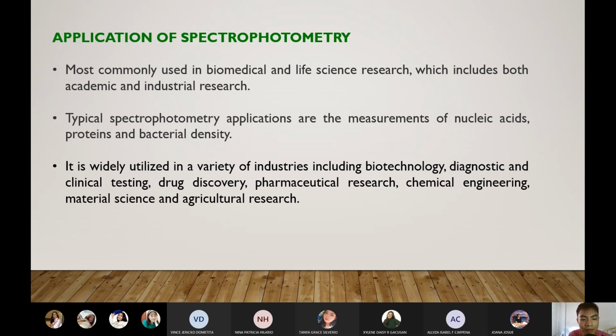So yan. My classmate now worked on a thesis which focused on the enzyme activity of a plant, no. Ayun. So to determine the enzyme activity of that plant, no. Ayun. Gumamit siya ng UVVs, no. So hindi lang siya limited to determining the concentration of metals, so on and so forth. Pwede nyo ito magamit sa biochemical applications. Okay?